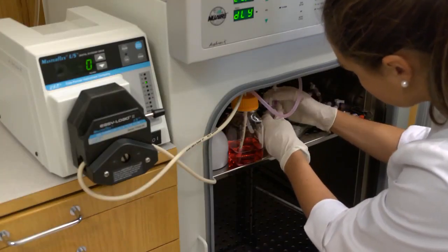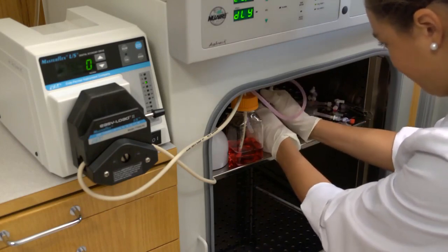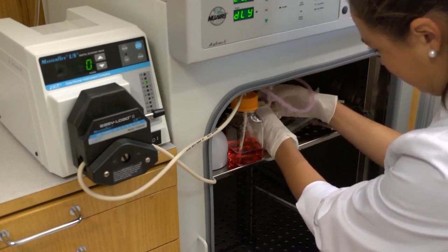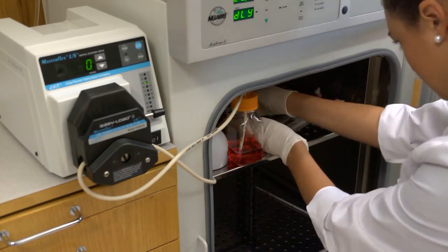During the flow experiment, the flow chamber can be removed from the circuit to image the cells via light or fluorescent microscopy. To do this, disconnect the flow chamber from the flow circuit at the stopcock to stopcock connections.